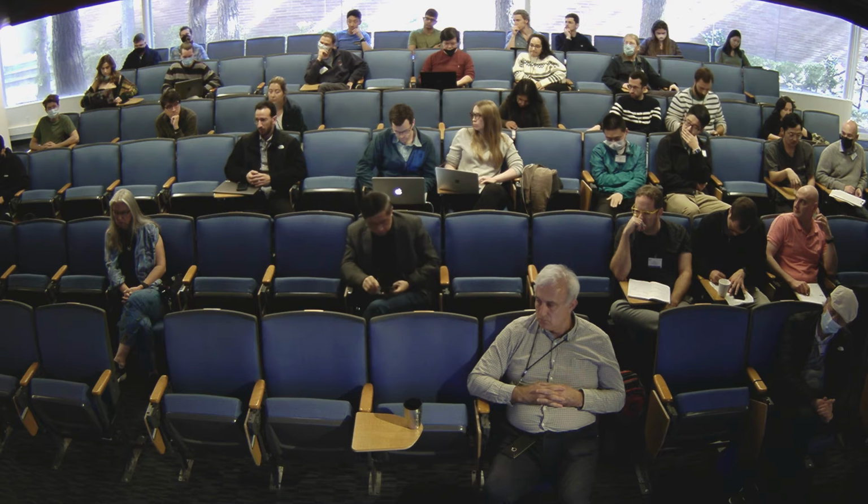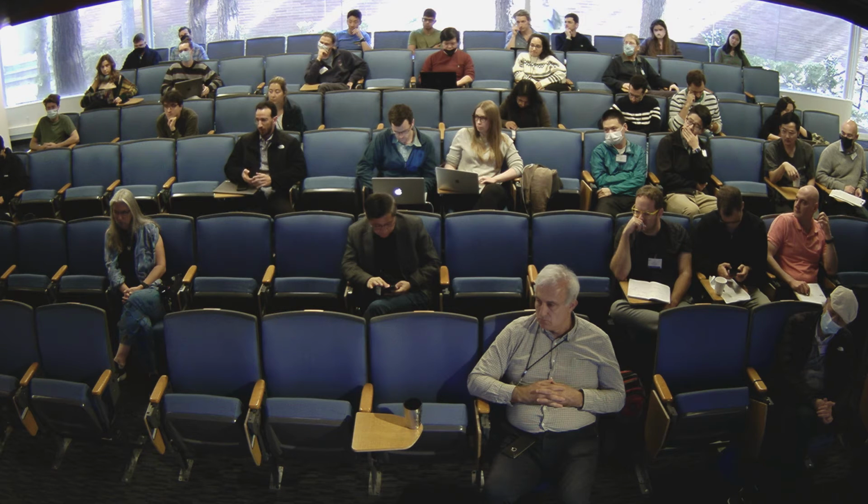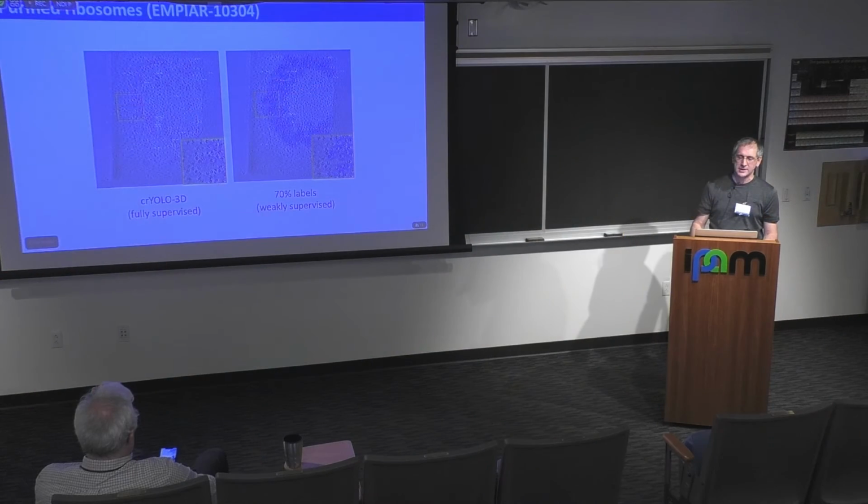How can you do this practically with, for example, cryo? You mean the data collection? Yes. Like, is there a script that you run? Oh yeah. These days the beam image shift is, I think, even part of EPU or TOMO 5. That's from Thermo Fisher, and there are multiple implementations. But it's really easy. There are scripts for SerialEM. I think that's what PACE-tomo does.